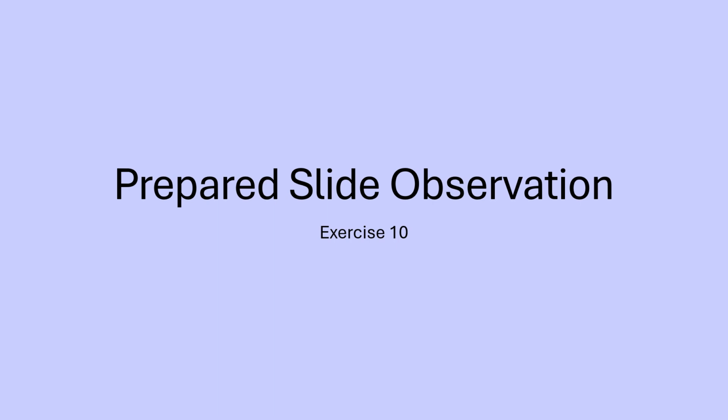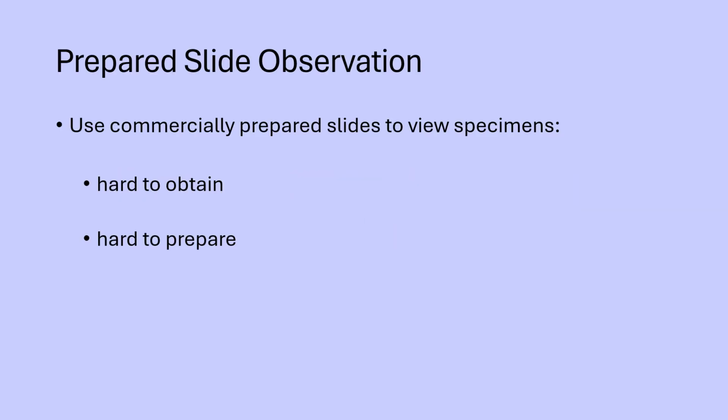In this exercise, we're talking about looking at different slides under the microscope. Instead of making the slides yourself, sometimes you will use slides that have been commercially prepared. Why would you use these versus making your own? Sometimes the samples may be hard to obtain.